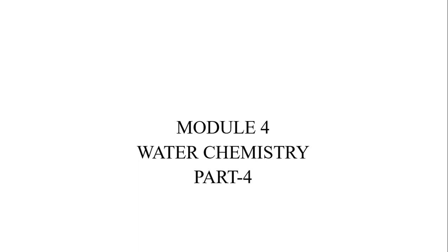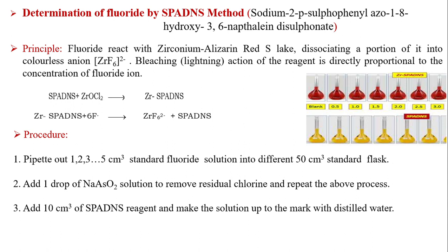Welcome back to online classes, Water Chemistry Part 4 under Module 4. Today's topic for discussion is estimation of fluoride in a water sample.